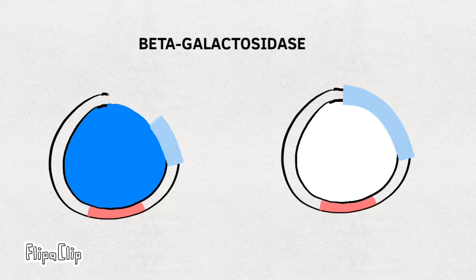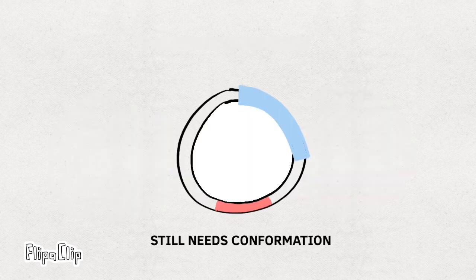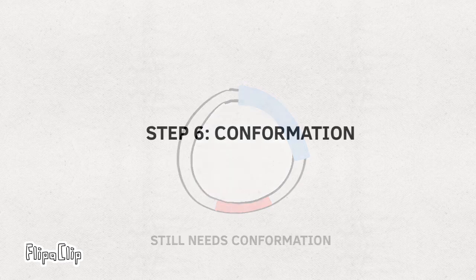This will cause the disrupted B-gal gene to become functional, and acting on its substrate X-gal, B-gal will give rise to blue colonies. But if we were successful in inserting LC7A, then ligase will stitch the insert into the vector, therefore permanently disrupting the B-gal gene. This will give rise to white colonies. However, just because the colonies are white does not mean that the insert worked, so confirmation must be performed.